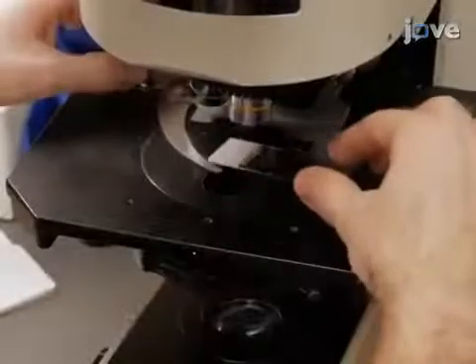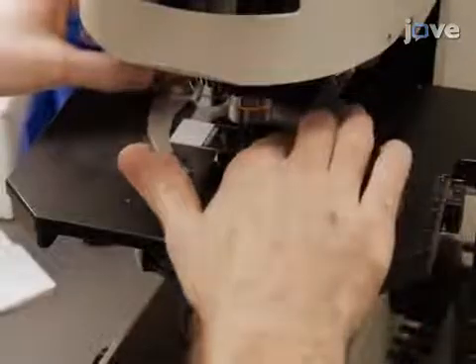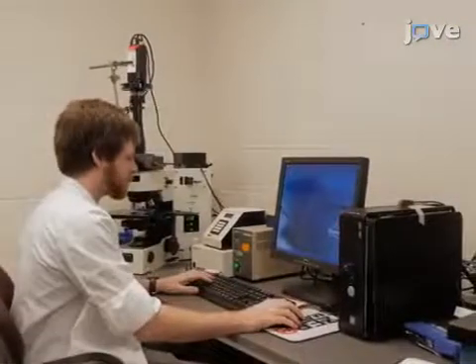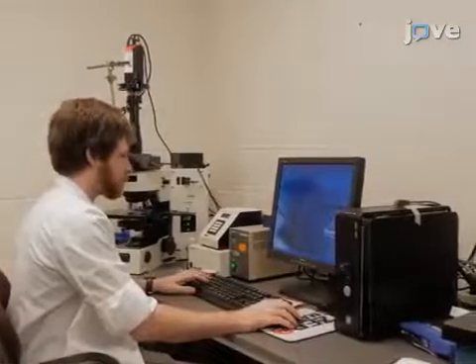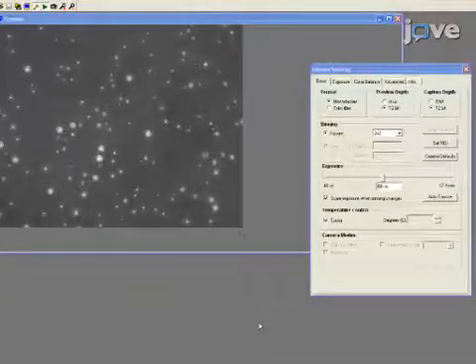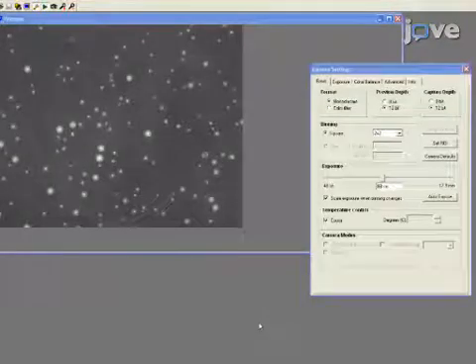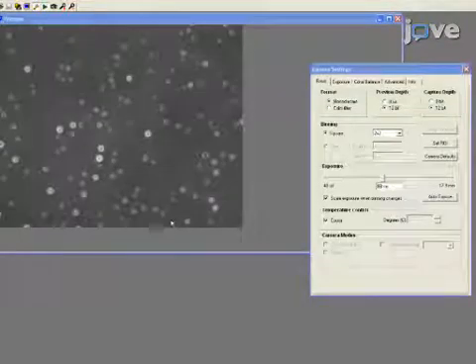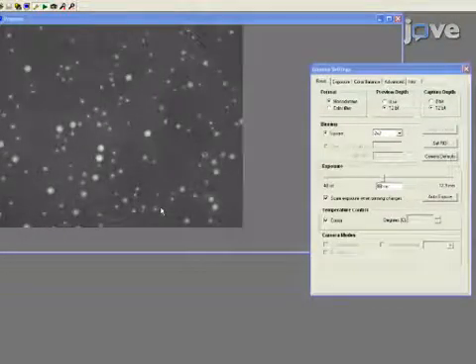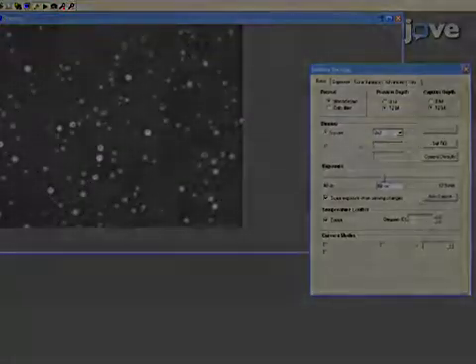To image the samples, place a slide under a brightfield microscope with the camera attachment and known pixel-to-micron conversion. Adjust the filters, objectives, and contrast, and ensure the field of view is dense but not overpopulated with cryptococcal cells, with clear contrast between the cell capsule and the background, and properly focus.